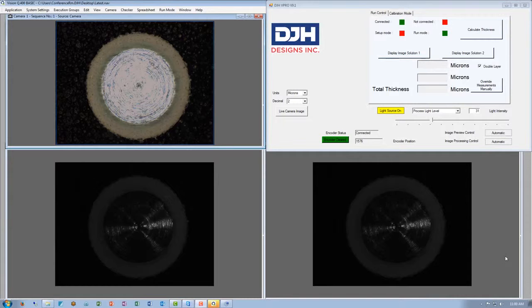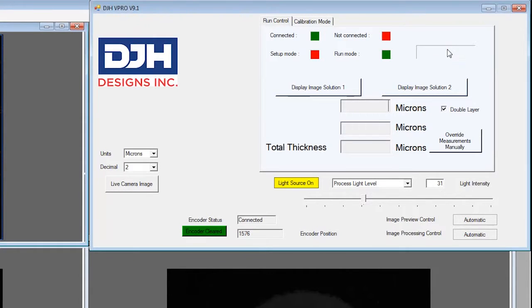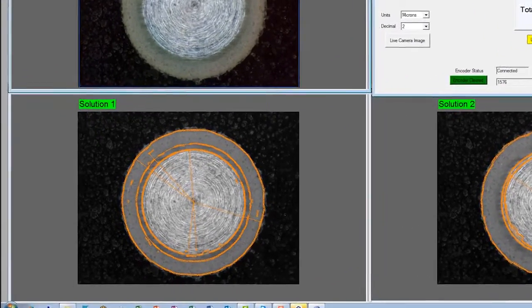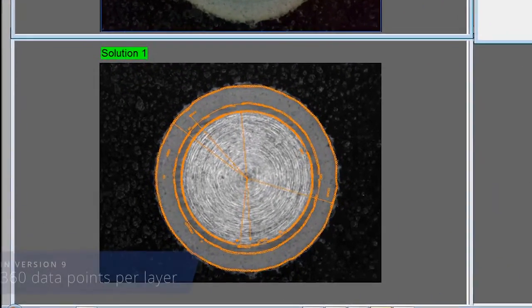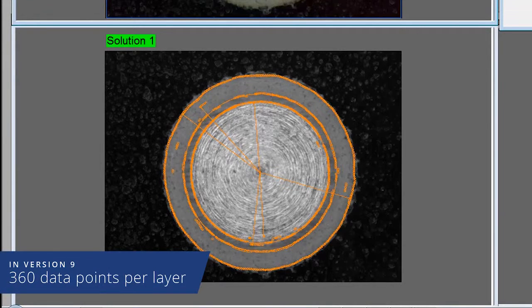The first thing we'll look at today is the automatic image processing. When we click Calculate Thickness, you'll be presented with two images. vPro will use independent algorithms to determine the proper measurement solution. Using the advanced algorithms, vPro will define up to 360 data points per layer.